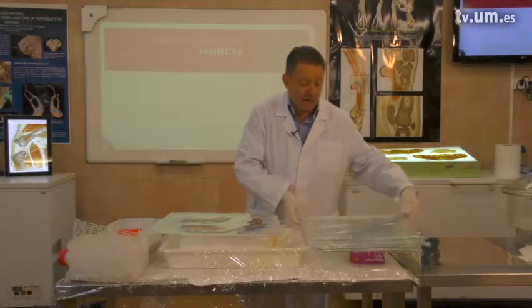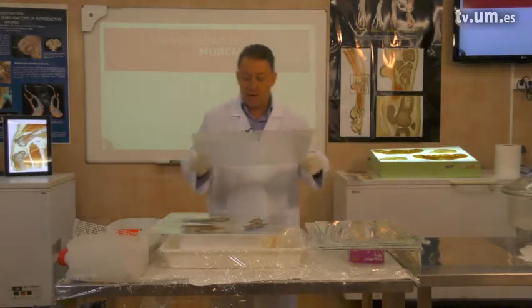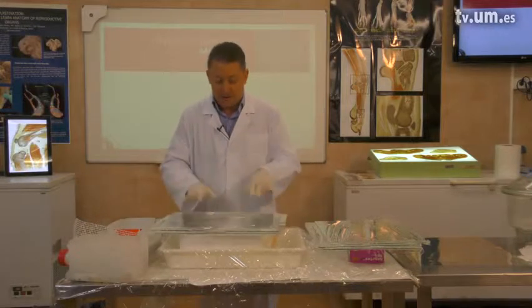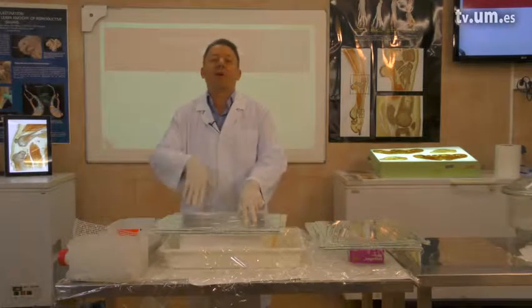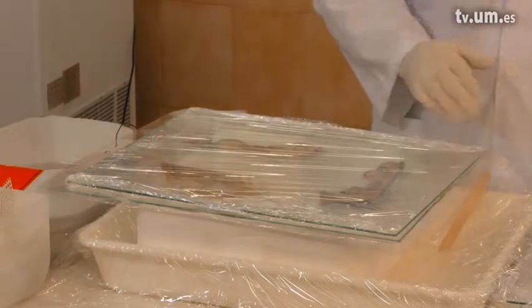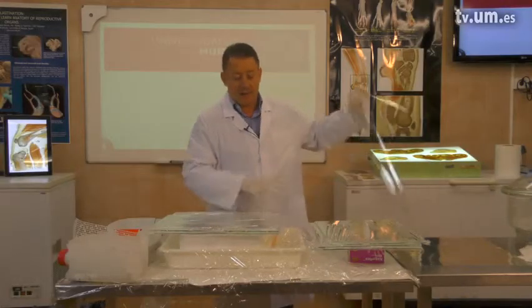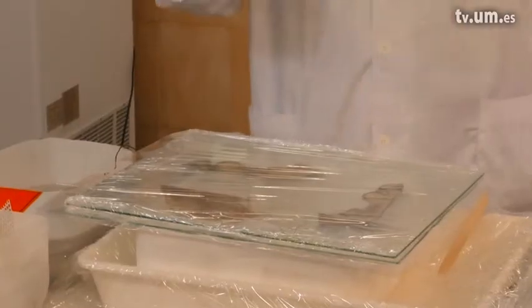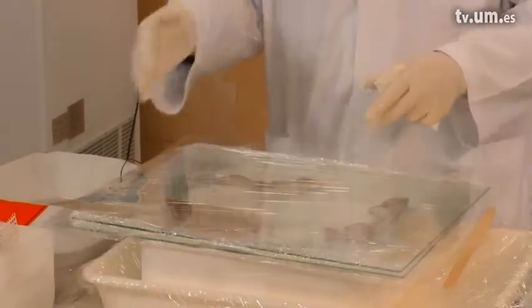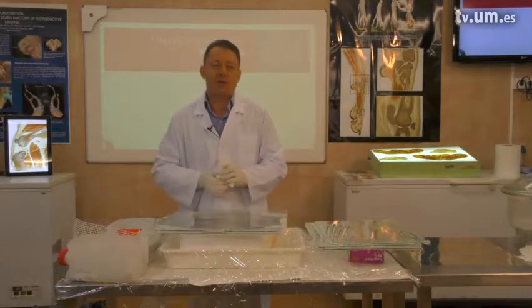Now we have to cover it with a second glass plate. It's time for another layer of our sandwich. For another layer we take another glass plate, another foil which we place on top, and we will continue until we finish all our slices.